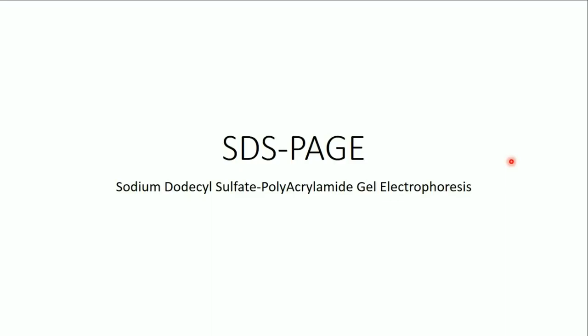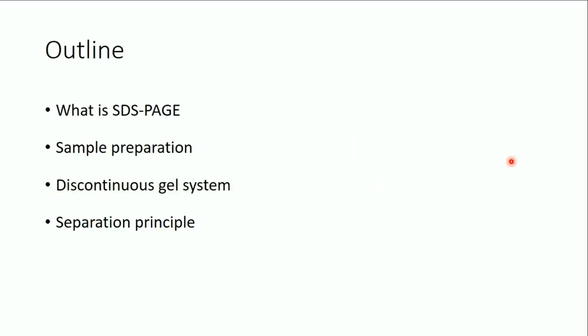Hello guys, in this video I'm going to speak about SDS PAGE, sodium dodecyl sulfate polyacrylamide gel electrophoresis. So I'll speak about several points. First, what is SDS PAGE, the sample preparation, the discontinuous gel system, and the separation principle. At the end of this video, you will get a very good idea about SDS PAGE. You will understand everything about the principle and the technique.